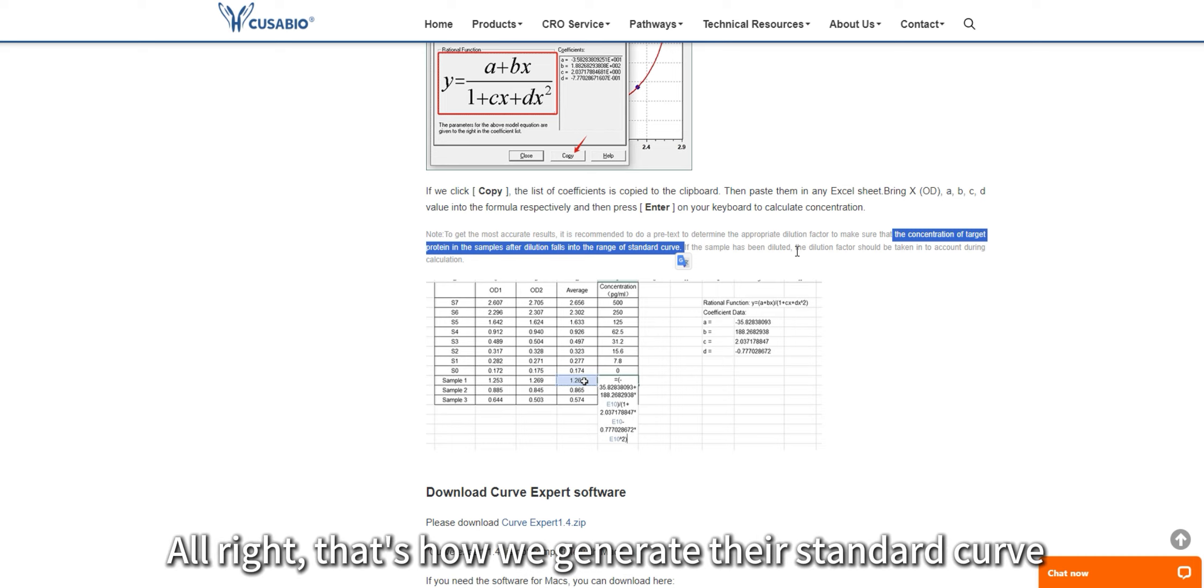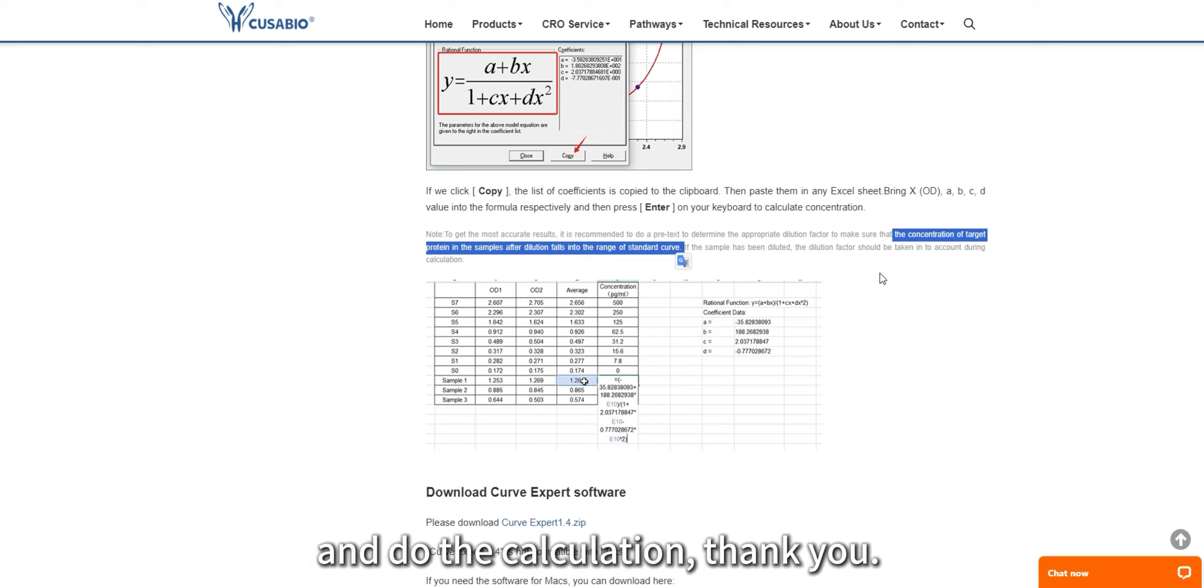All right, that's how we generate the standard curve and do the calculation. Thank you.